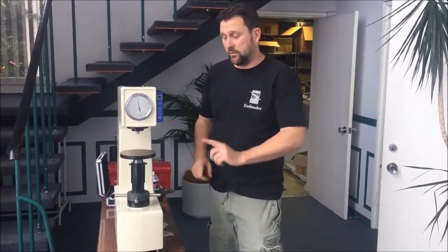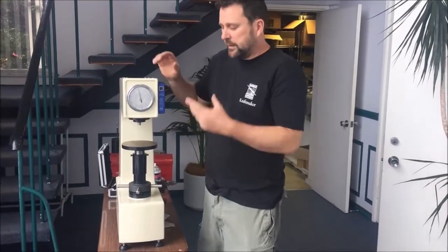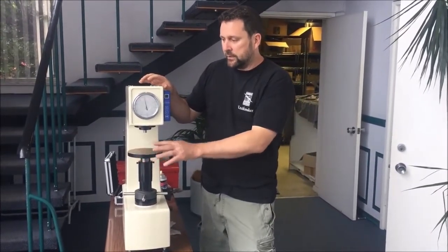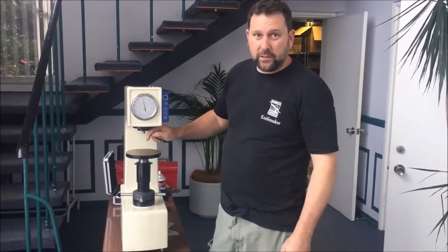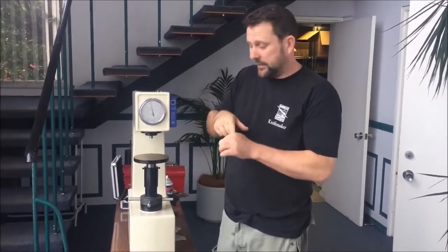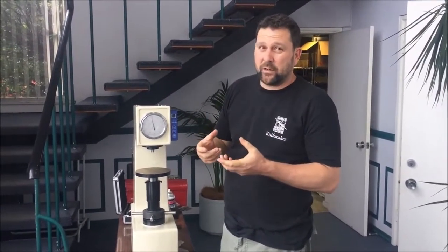We've mounted the hardness tester on a sturdy base, because it will work much better on a sturdy base. Let's talk about principles of operation. When we hit the start button on this, it's going to apply a pressure on an indenter. It's going to push a piece of diamond basically into a piece of steel, and it's going to measure how far it goes into the steel. By measuring how far it goes into the steel, we can determine how hard the steel is. That's the basic principle of operation.